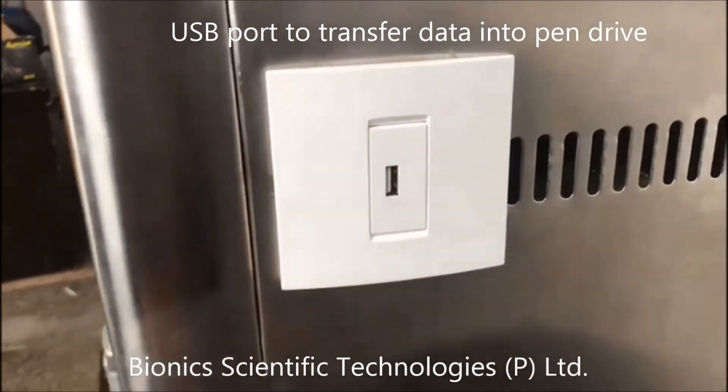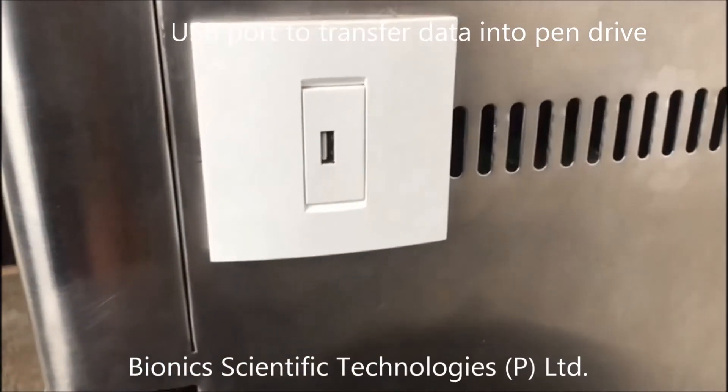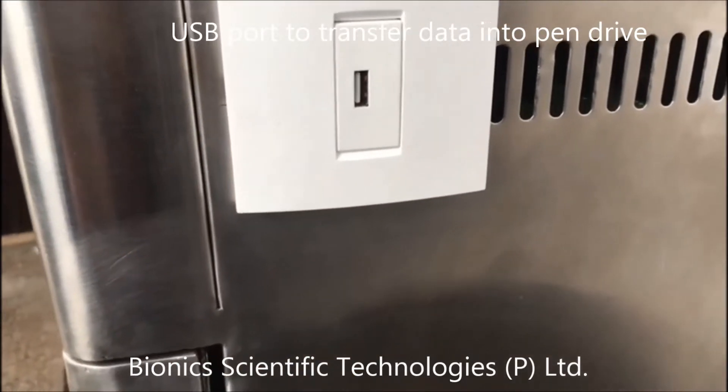This is the USB port, through which you can record your data as per your need. There is also an additional function available which I'll show you.